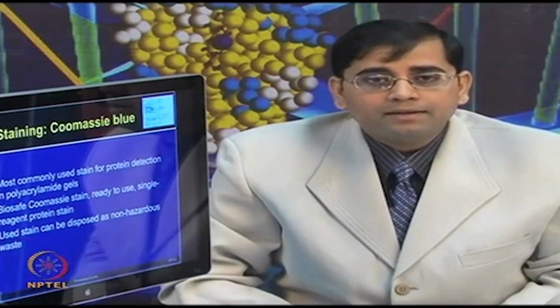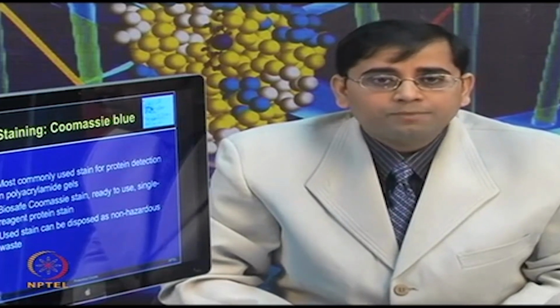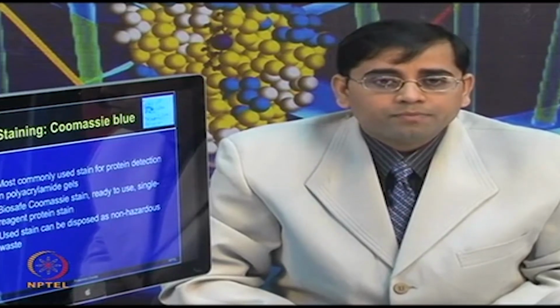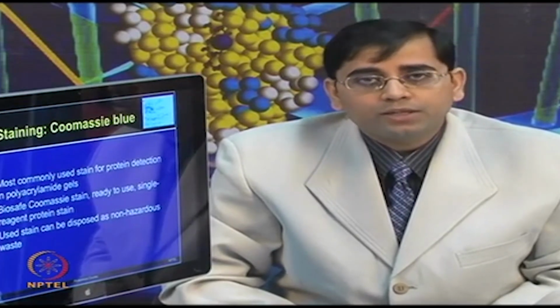Now, there are some advanced forms of Coomassie stains being developed, including BioSafe Coomassie stain, which is non-hazardous, made keeping in mind the environmental scenario. So, it can be disposed of as non-hazardous waste. The BioSafe Coomassie is also a ready-to-use stain and a single reagent protein stain.